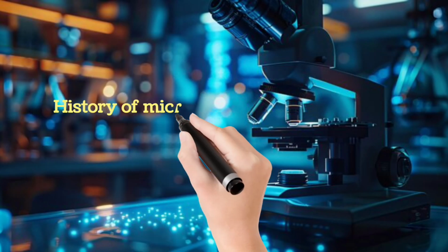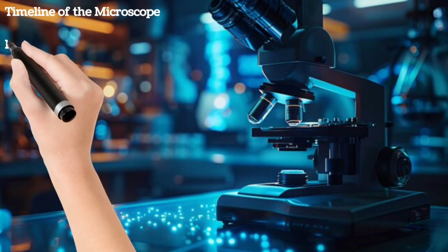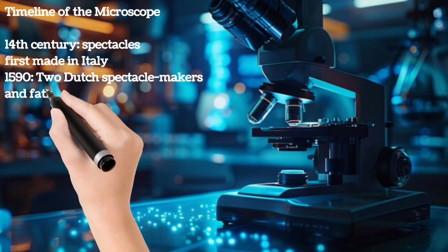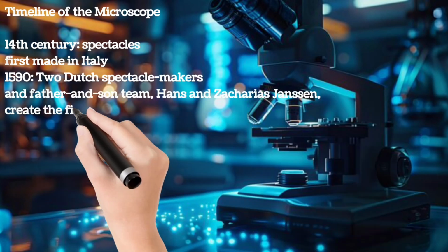History of the microscope. Timeline of the microscope. 14th century: spectacles first made in Italy. 1590: Two Dutch spectacle makers, father and son team Hans and Zacharias Janssen, create the first microscope.